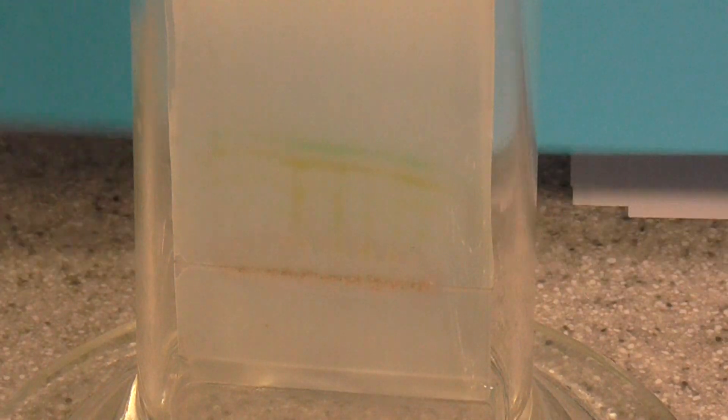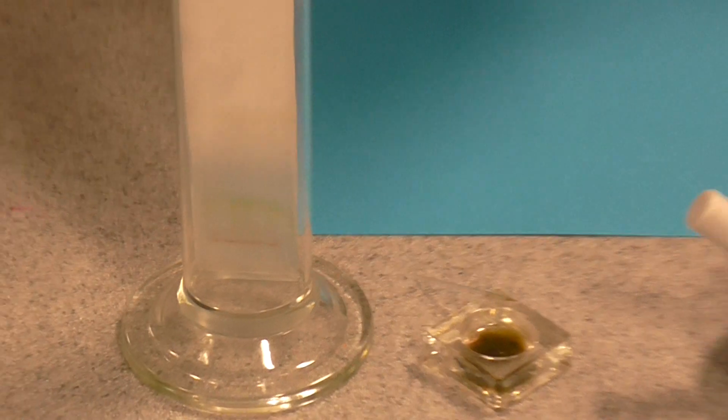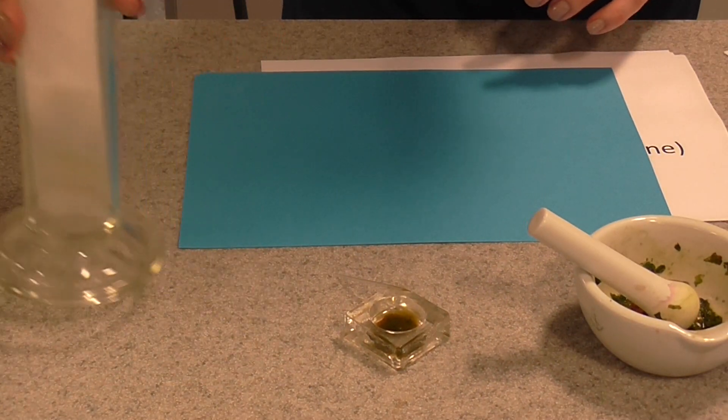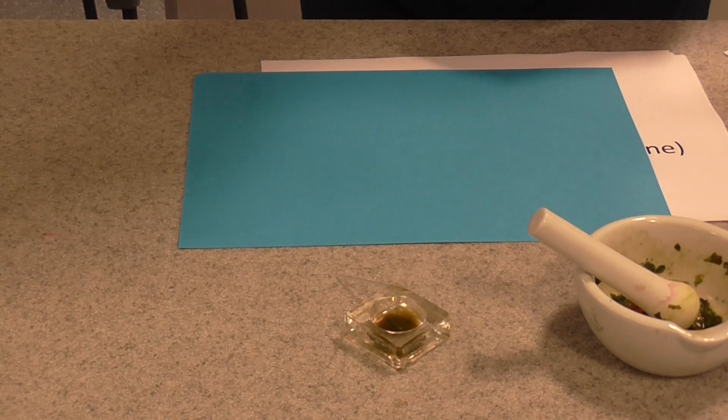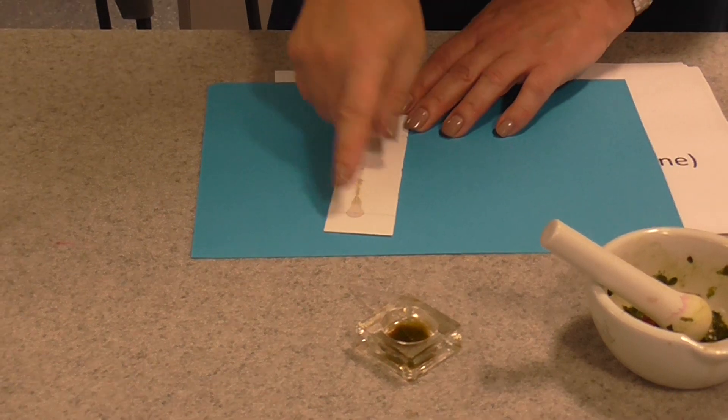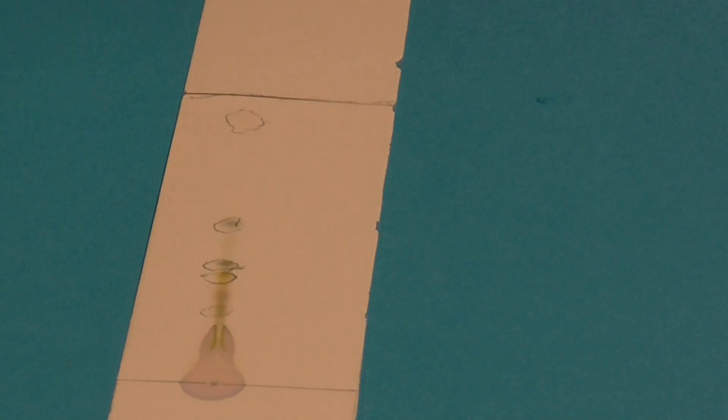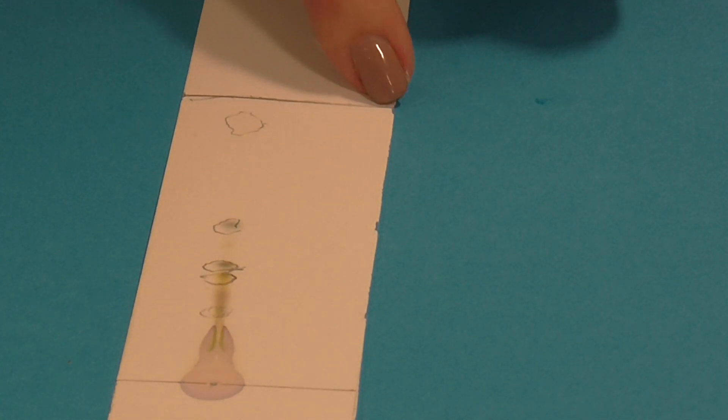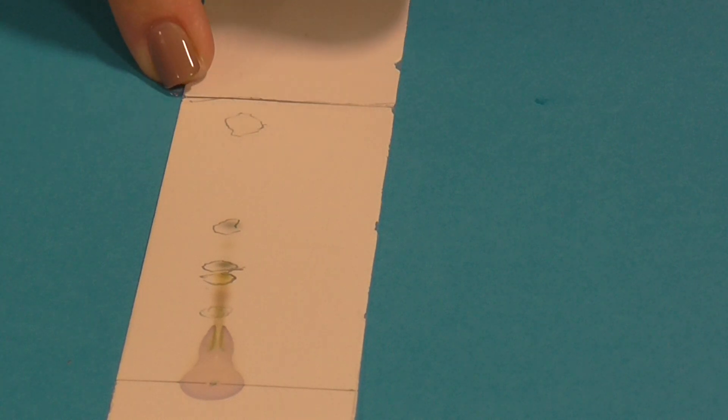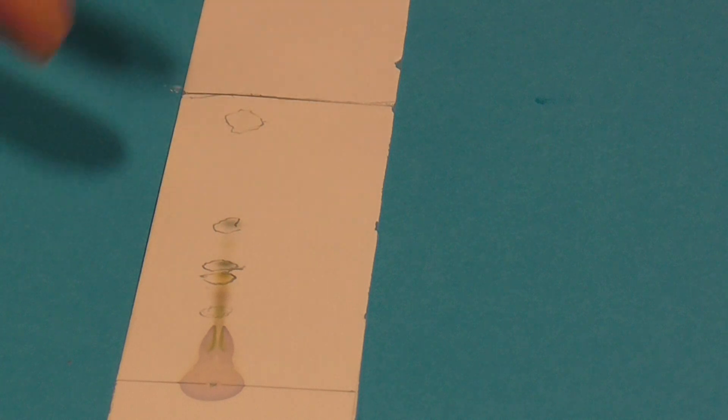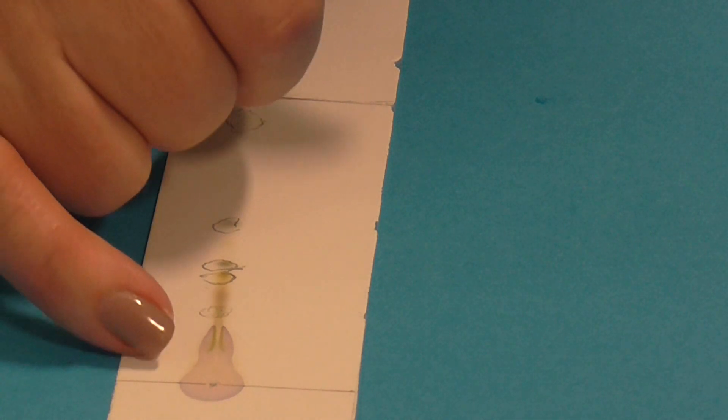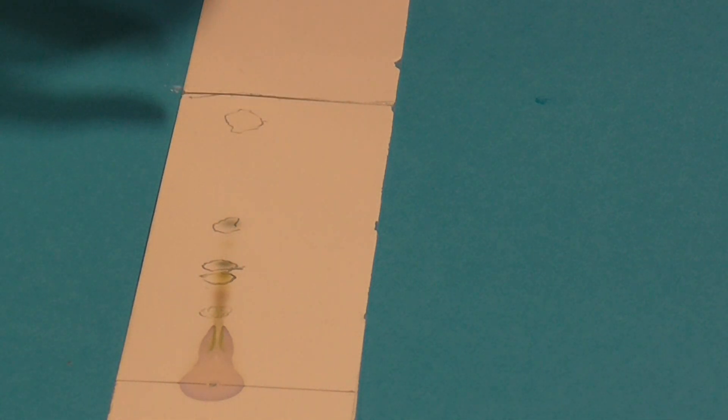When it gets near the top of the paper, you need to remove the TLC strip from there. This is the kind of thing you'll see. As soon as you remove it, get your pencil and you need to mark the solvent front, the point that the solvent's reached. Then you need to leave this to dry and let it dry naturally. Often you're told to use a hair dryer or put it in a warm place, but actually I find that makes the pigment spots fade.